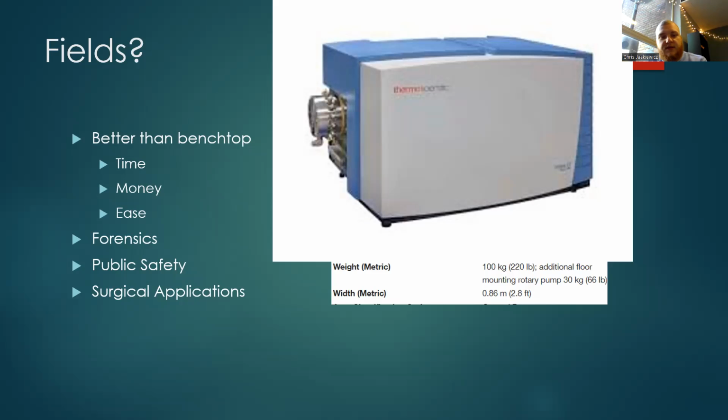Then finally, what I also listed here was a surgical application. So they're getting to the point where they're actually able to sense what cells are cancerous and non-cancerous in a biological sample using mass spectrometry, right? So this idea, I'll get into a little bit when we talk about ionization sources, but this idea of laser ablation, right?